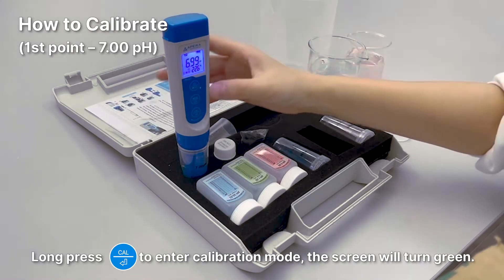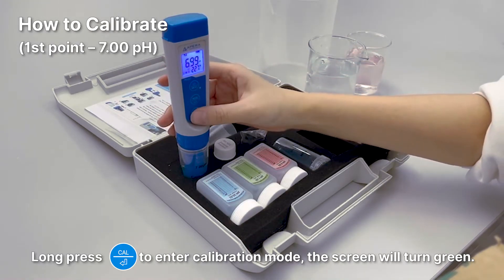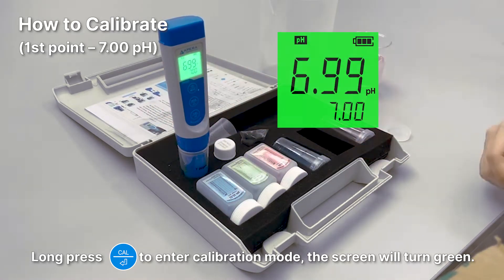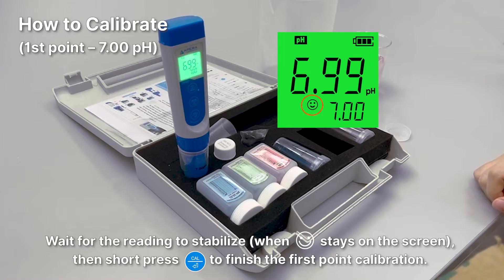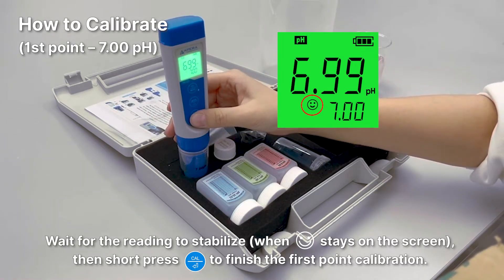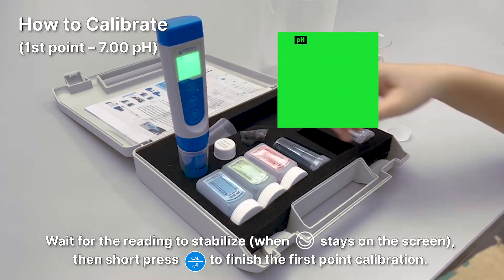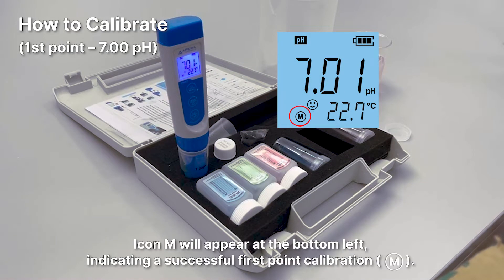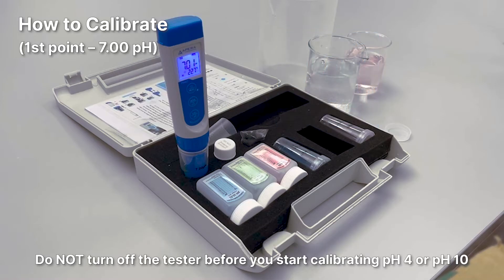Long press the CAL button to enter calibration mode — the screen will turn green. Wait for the reading to stabilize, then short press the CAL button to finish the first point calibration. The tester will return to measurement mode and icon M will appear at the bottom left, indicating a successful first point calibration.